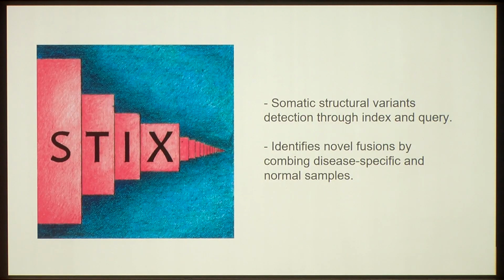So with STIX, trying to reiterate, there is no SV calling. You're really indexing and you're querying. And for the sake of increasing sensitivity, we're combing through disease-specific cohorts and healthy cohorts to find novel fusions.